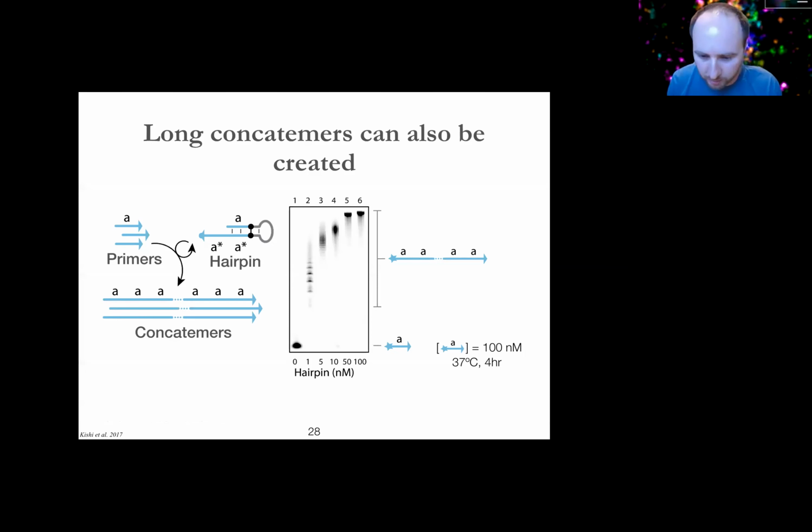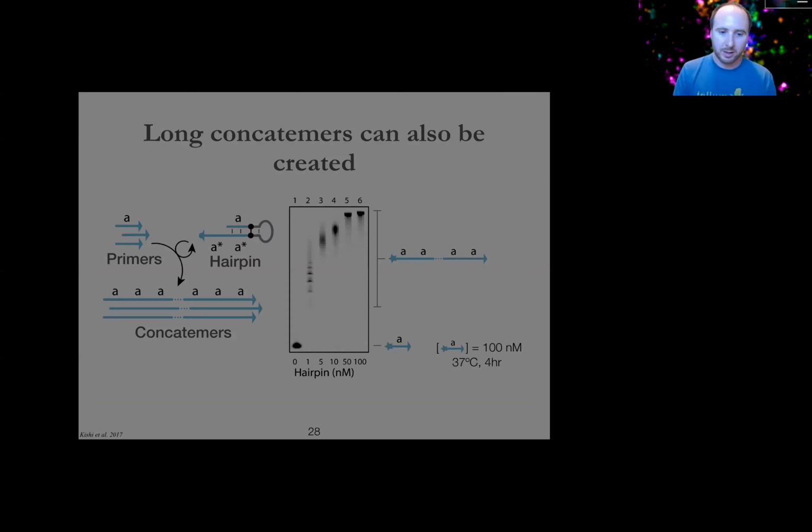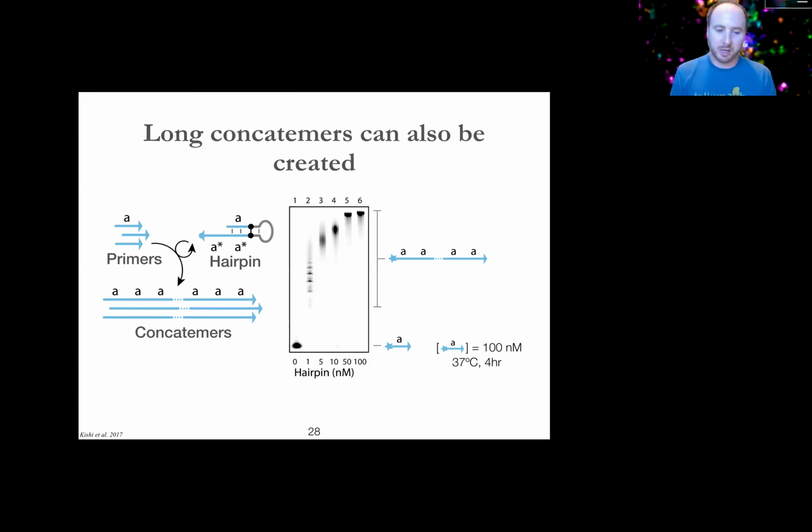Okay, great. But jumping ahead now to the cellular case, this becomes really powerful for us when you encode A star in the place of where B star was on the previous slide. So you basically copy the same sequence onto itself. What happens when you do this is that every time you make an extension, the molecule you've made is then capable of being extended again because it has the right sequence to bind the relevant part of the hairpin to allow it to be extended. So what this effectively does is concatemerize the molecule you're extending, making many, many copies of a short sequence that's repeated over and over and over again.